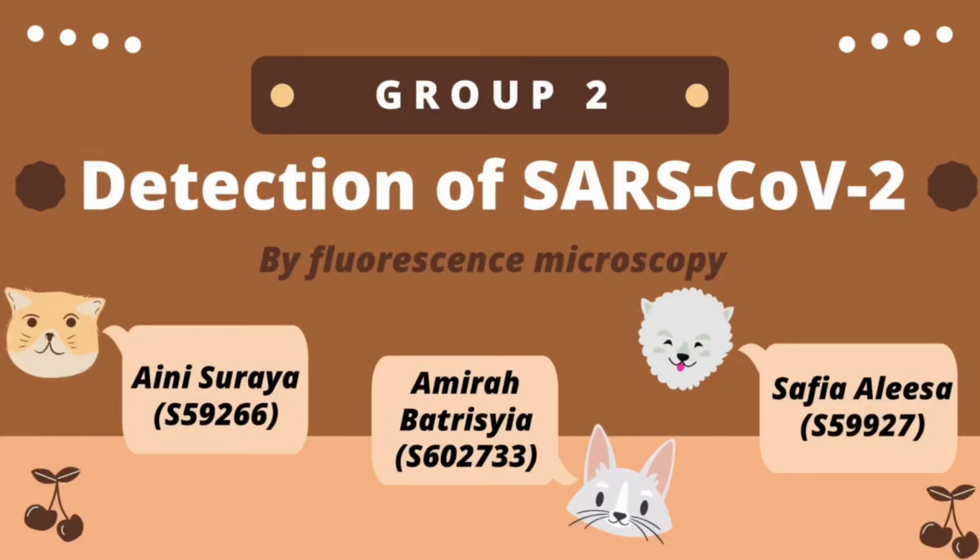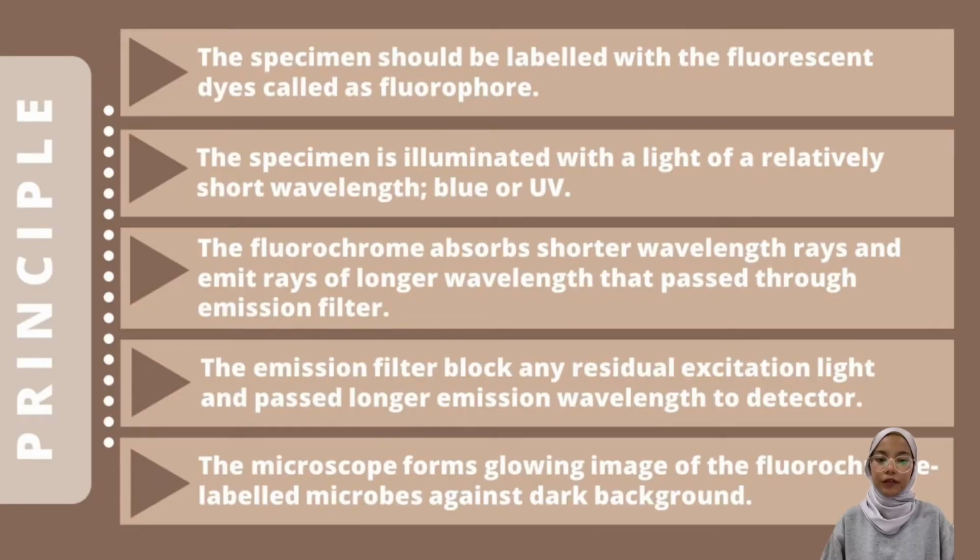Assalamualaikum and hi everyone. We are going to present our topic, which is the detection of SARS-CoV-2 by fluorescence microscopy. We're going to cover the principle, the advantages, the method and the limitations of fluorescence microscopy. Going to start with the principle.